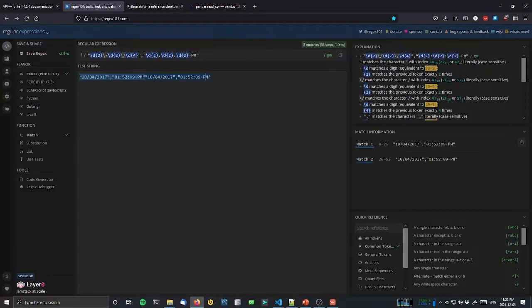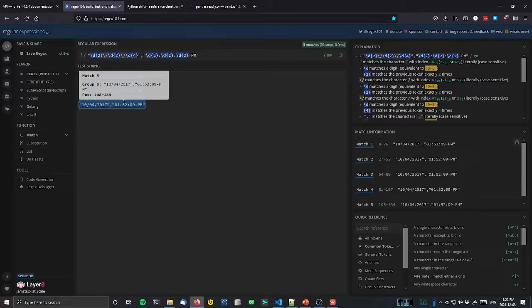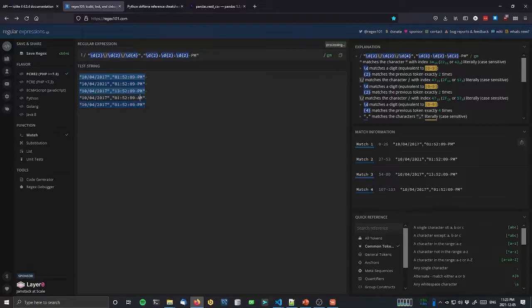Oops, and each one in a new line, just so that we can be sure that it's working. And what I'll do is I'll then make some variations on that. So what if this was say 2021, that still matches, that's great. What if this was 13, that still matches. What if this was AM instead of PM?